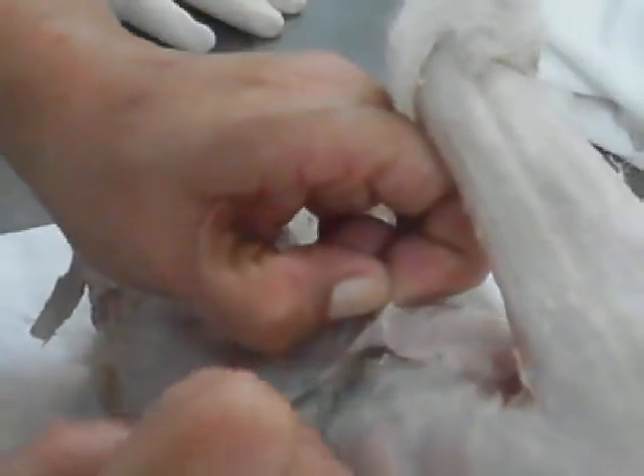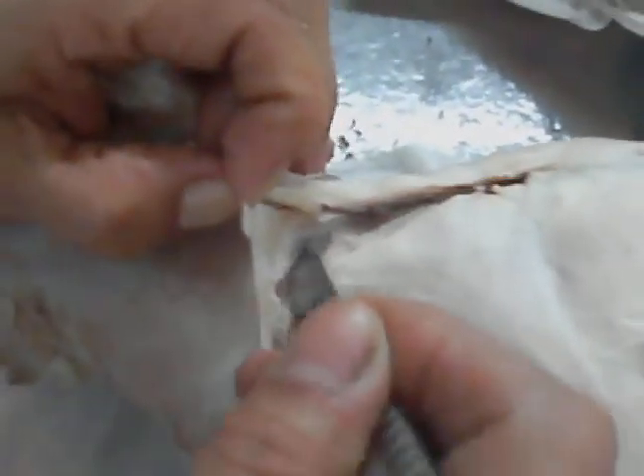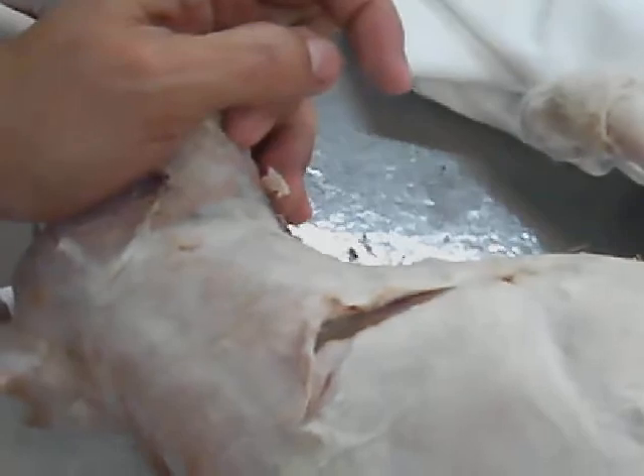On its side view, lift the clavobrachial. You will know if what you have done is correct if you insert the forceps. Once it comes out when you cut it, then it's correct. So this is now the clavobrachial — from the shoulder down. And from the clavotrapecius down there, we call the whole muscle as clavobrachial.